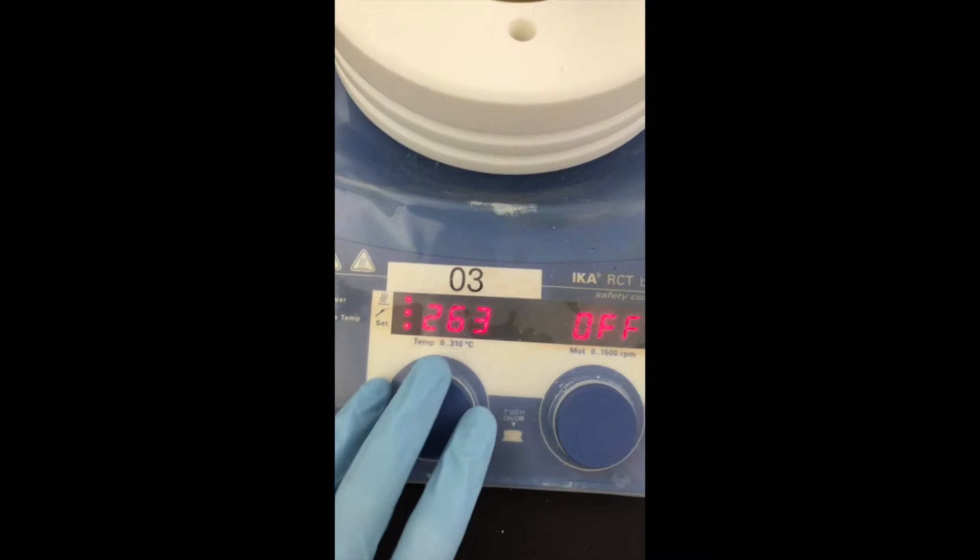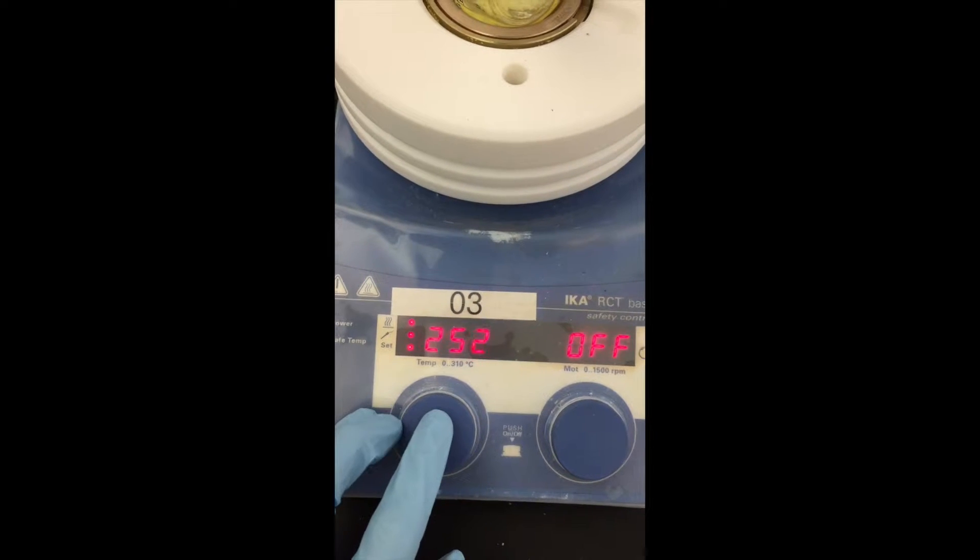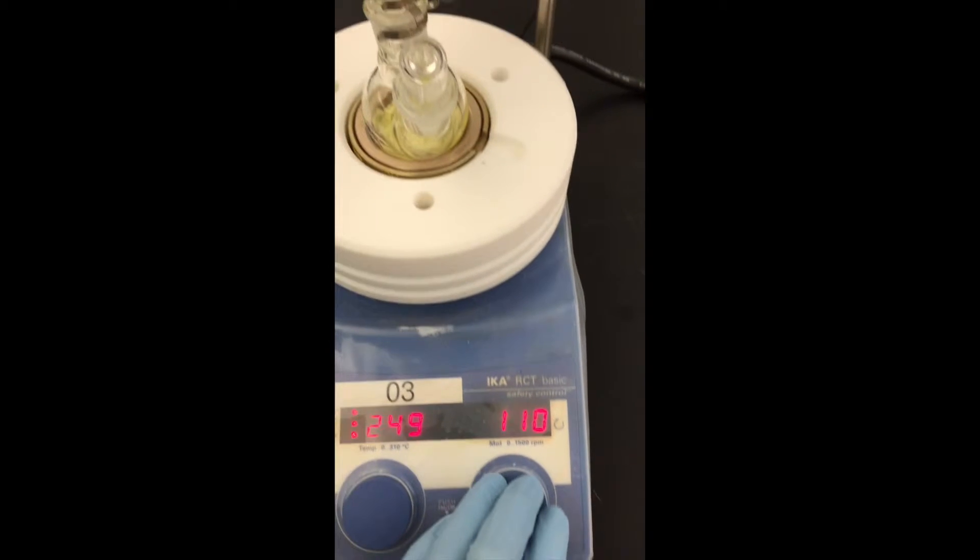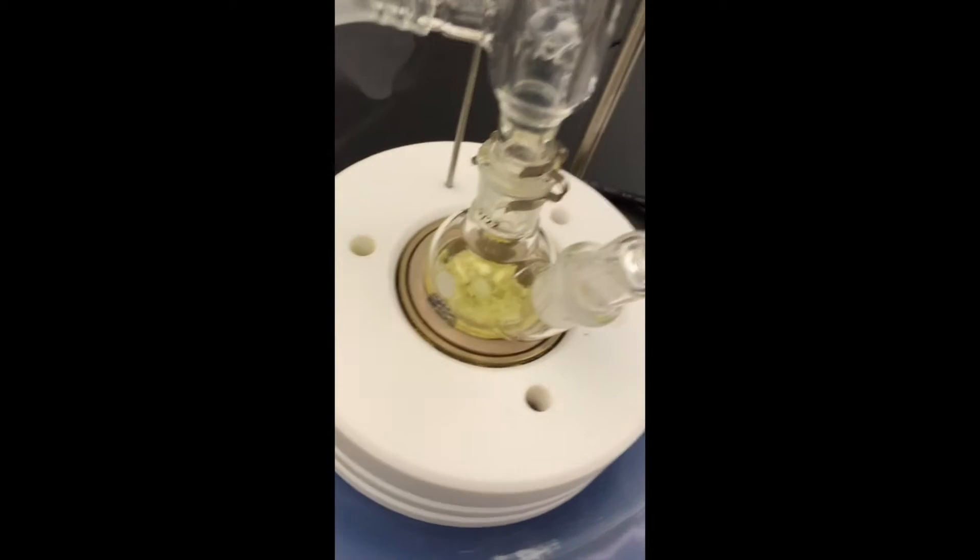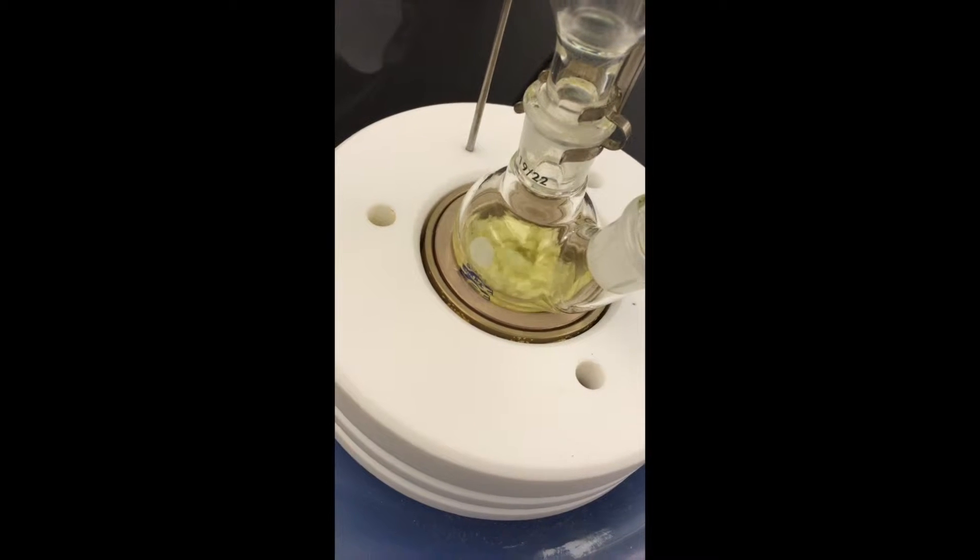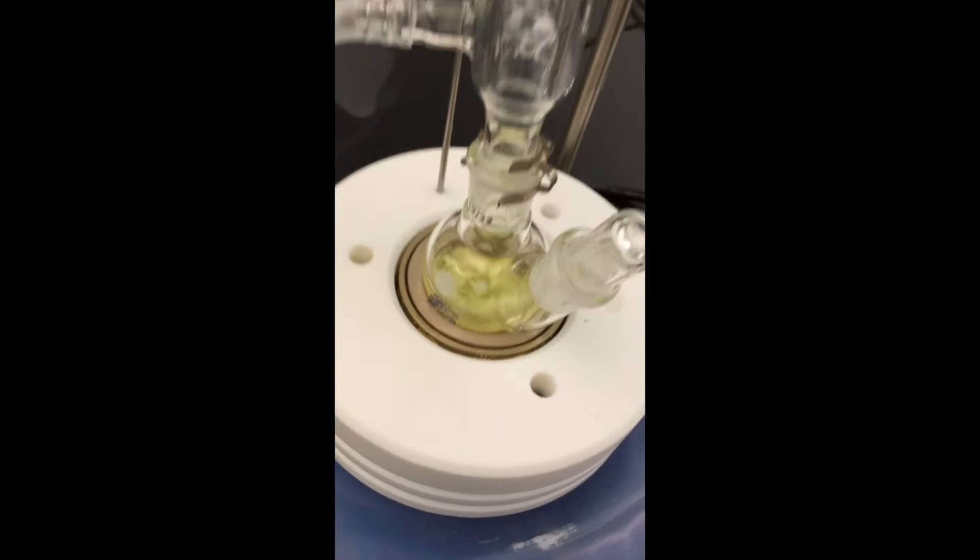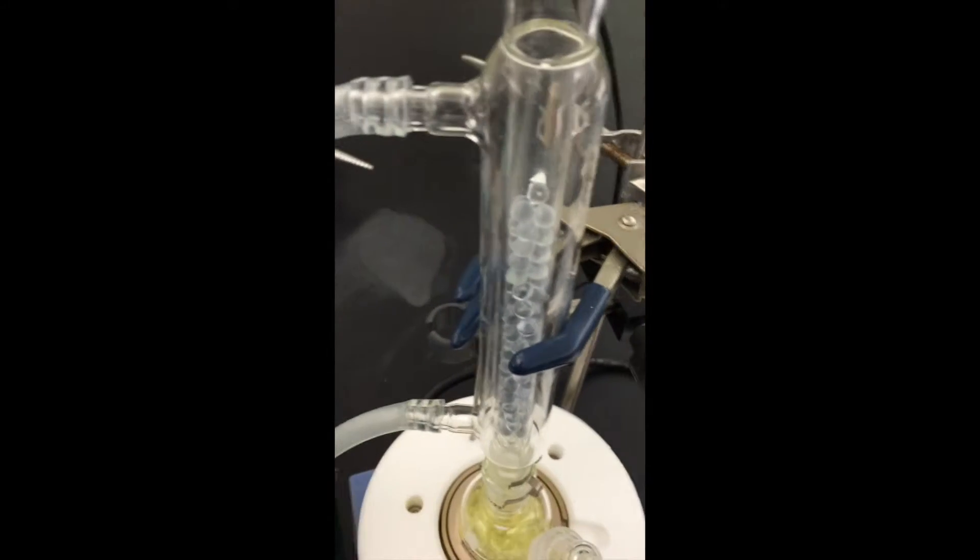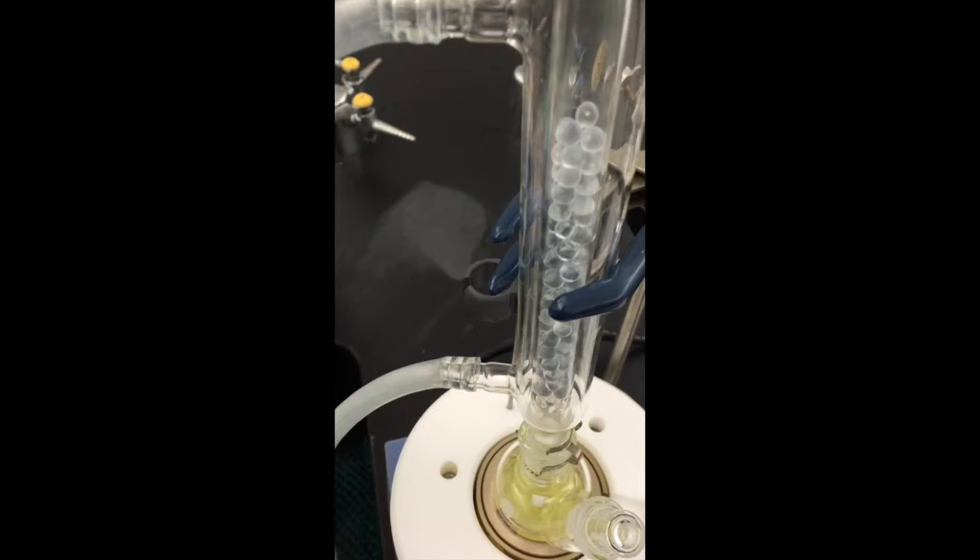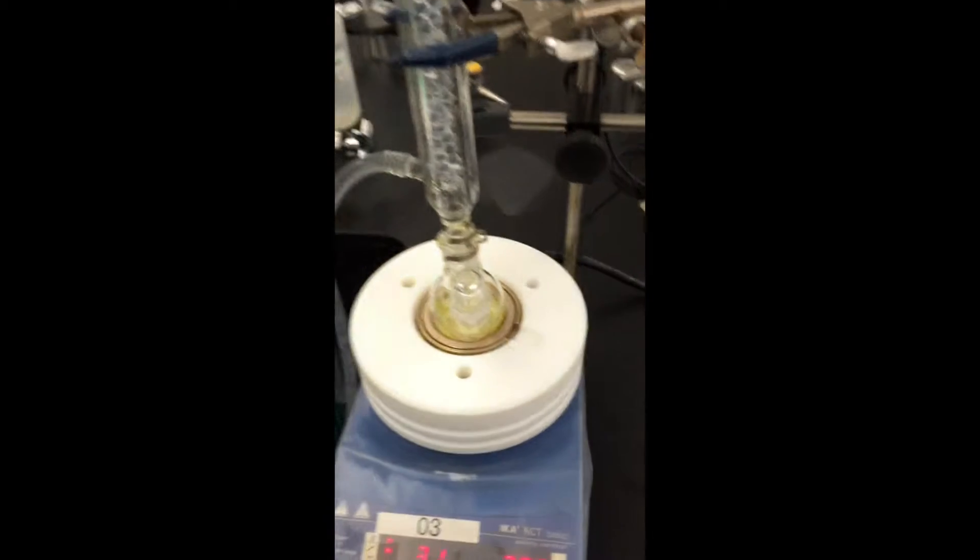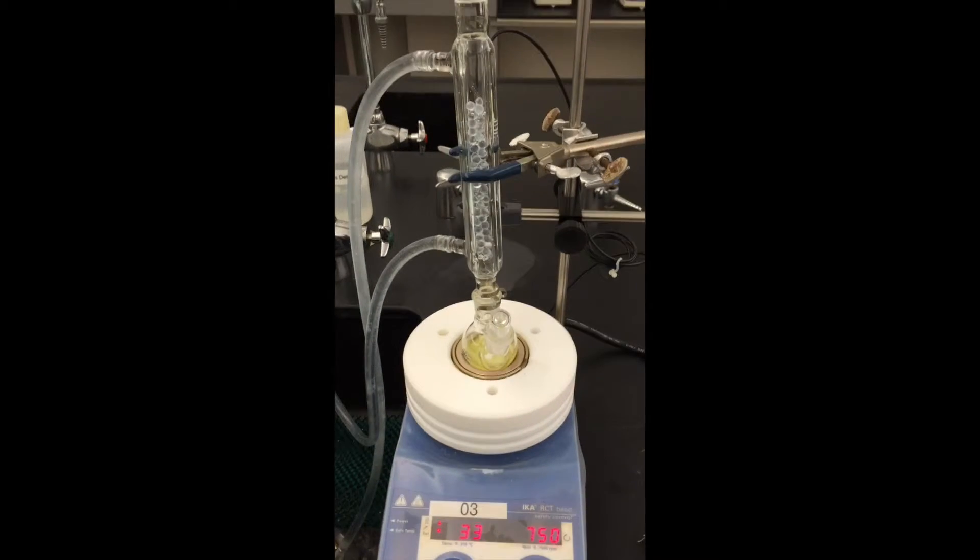We are going to set to 250 degrees. And the magnetic stirrer in there. We are going to start stirring. And we are going to mark the time and reflux for an hour. We will turn on liquid condenser. It's running. And we will go for one hour.